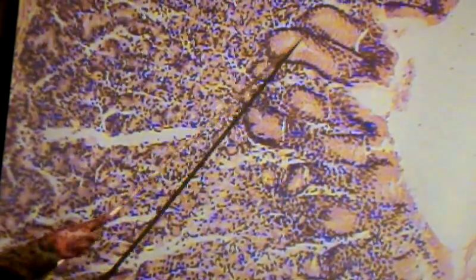But you can only really reliably see the epithelium at the surface and in the gastric pits right here. I know that this is kind of fragmented and debris doesn't make it any easier, but if we zoom in on this, we'll see our simple columnar epithelium.